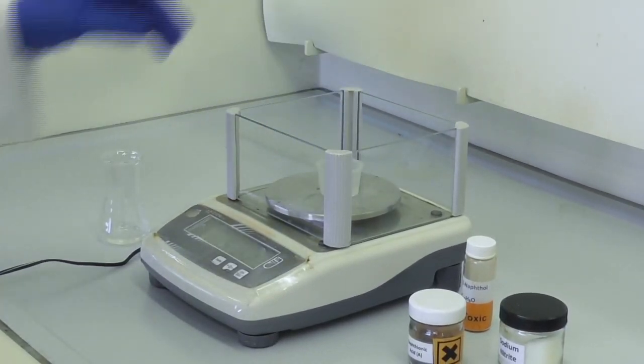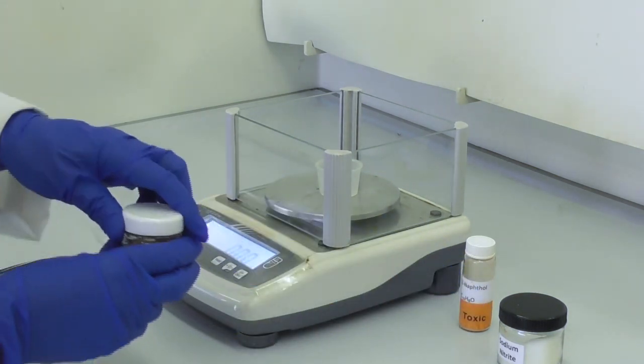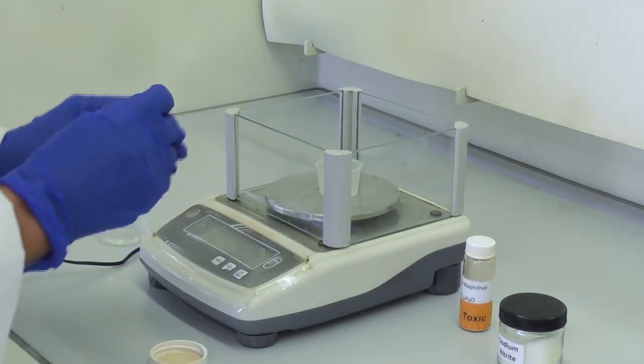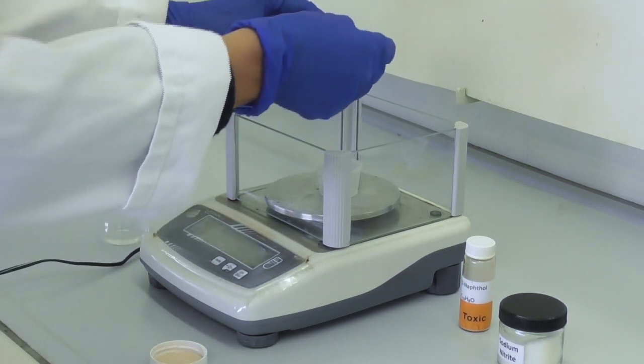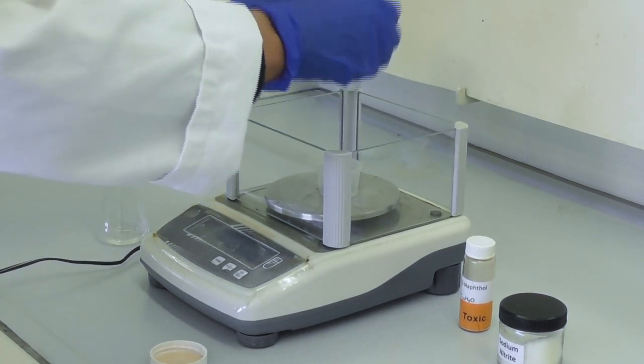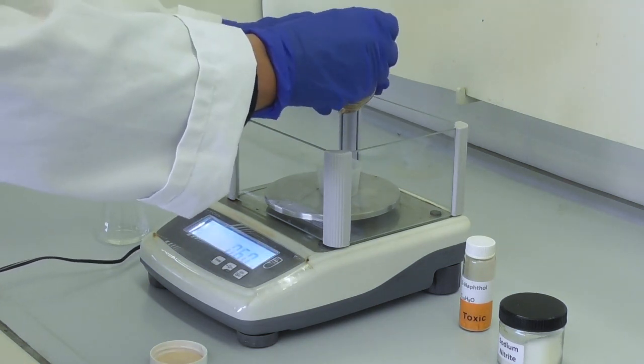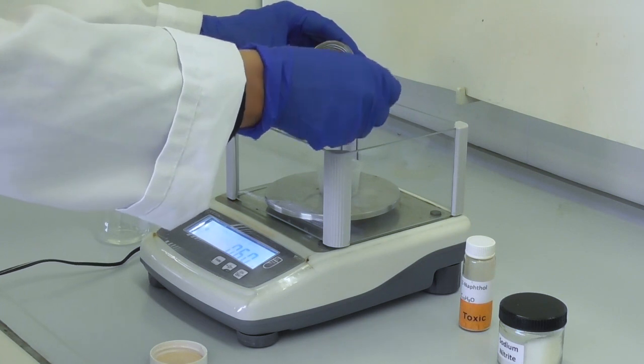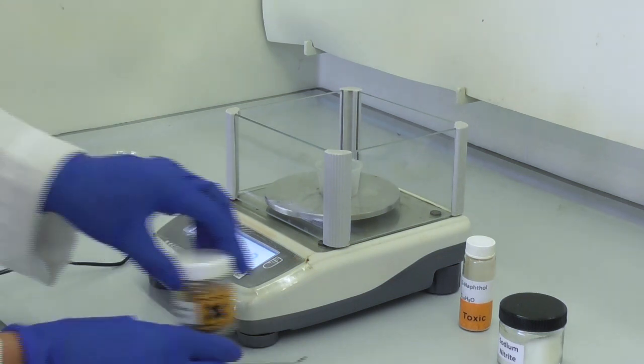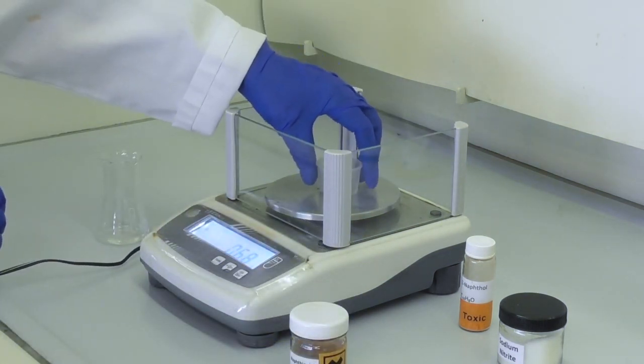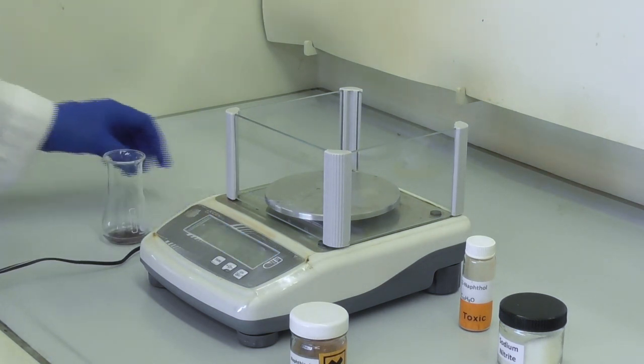In the fume hood I weigh out 0.65 g of naphtheonic acid into a weighing bottle, and then transfer this straight away into my phosphoric acid solution.